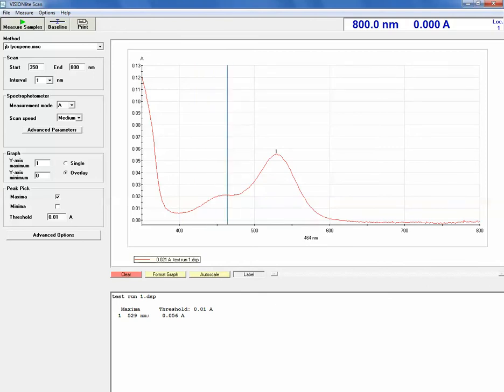It kind of flatlines out a little bit. And then at 500, we see the absorbance go up even more. And then after this number, that's a hump, right? After that number, the absorbance just begins to plummet, and it goes all the way down almost to 0. So it's telling me that there's no absorbances in the range of 600 to 800 any longer.